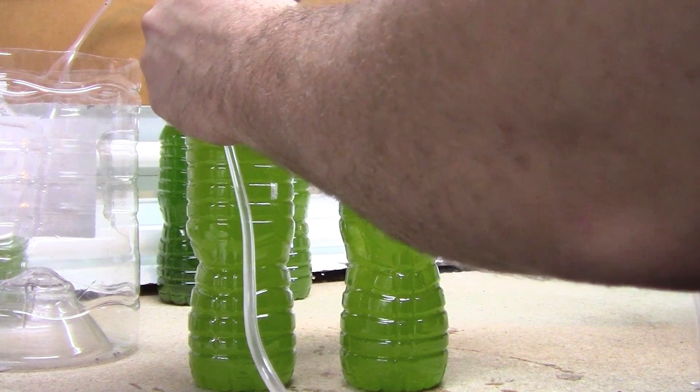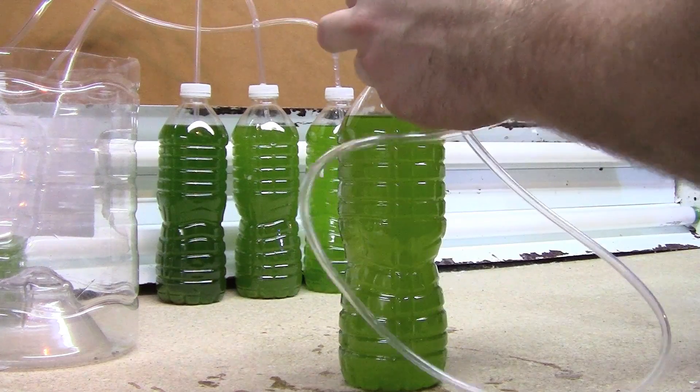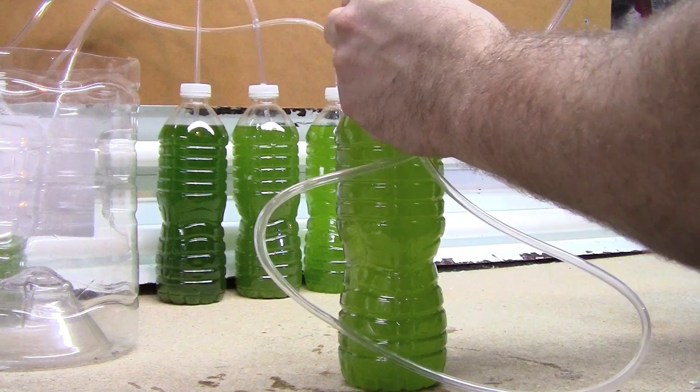Right here I'm finishing up — putting in the rigid airline tubing, hooking up the flexible airline tubing to the gang valves, plugging everything back in, and kicking the lights back on.